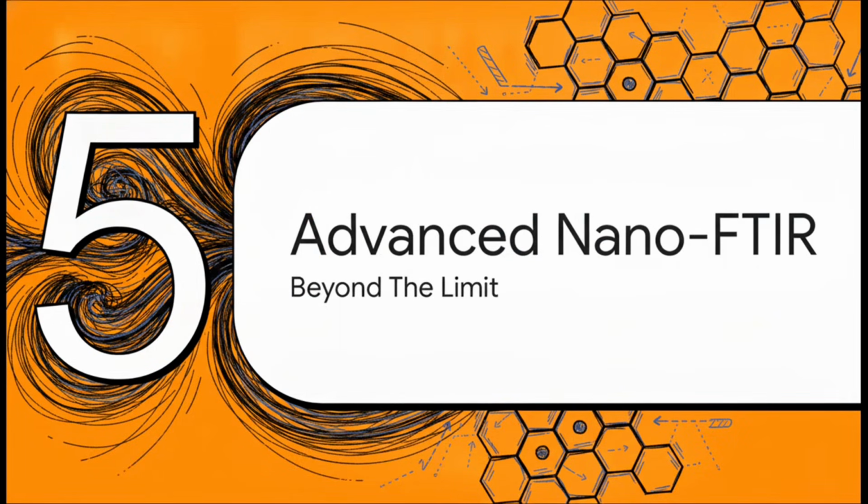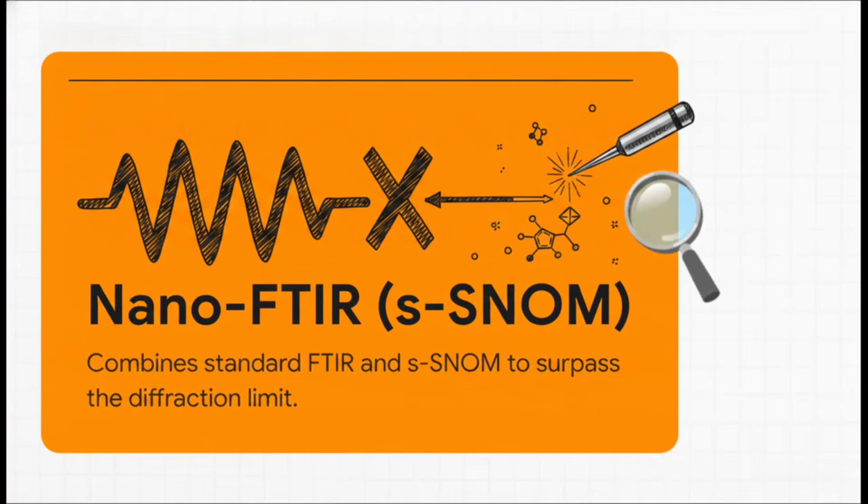Section 5. Advanced Nano-FTIR. Because as amazing as standard FTIR is, science literally never stops pushing the boundaries. Let's look at the cutting-edge evolution of this tech. You see, conventional FTIR has a physical limit based on the wavelength of light itself. It's called a diffraction limit, and it severely restricts just how small of an area it can actually analyze. Well, Nano-FTIR completely shatters this barrier.